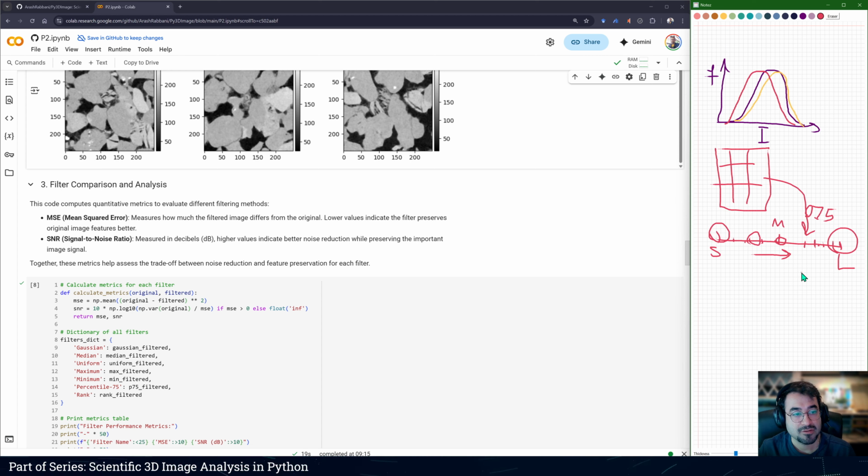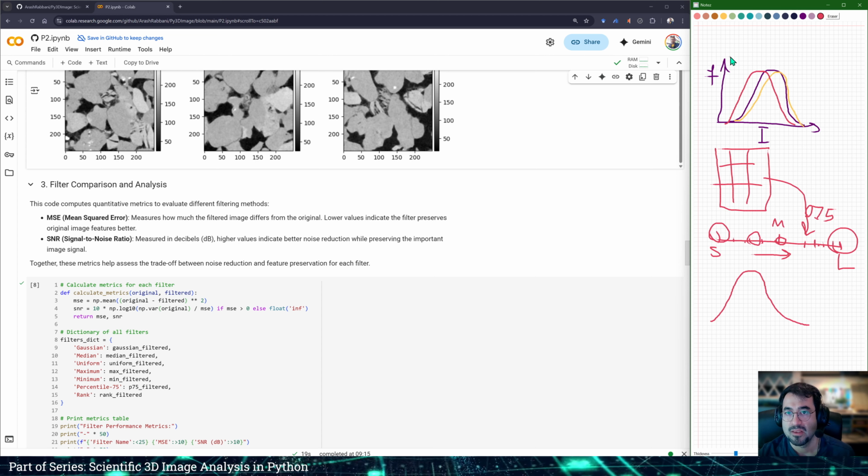And then we have something else called signal to noise ratio, which is actually telling us, if we have a signal, a signal is just information. It could be something like this, right? When we go from right to left of an image, the values could change like this. But at the same time, we could have some noise. So these transitions are not smooth when we change the location in the image, right?